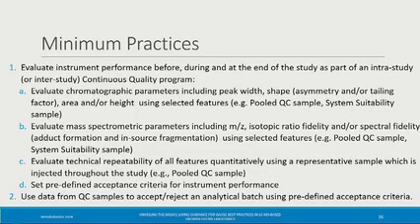Yeah, thanks. So I wonder what happens if you reject an analytical batch, because then you probably have to check re-injection stability, or you have to rethaw your samples. So what's your advice on these kinds of things? Do you validate up front whether you can freeze-thaw multiple times or re-inject your samples?